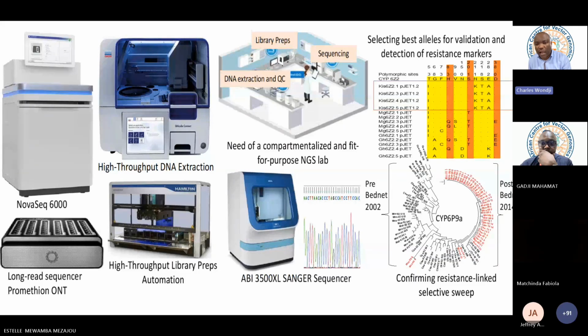There will be a webinar on how you can do your next generation sequencing at CRID through AVecGen. That was not the purpose for today. Today we were starting with the ABI Sanger sequencing, and I think you had a clear explanation. We are doing the long read sequence, short read with NovaSeq, but the long read also will be possible, and the platform really will be there to allow the community to address many research questions that you have, but you are not able to achieve because you cannot sequence often or quickly. So that's the overall of the presentation that you may have missed because of the quality.